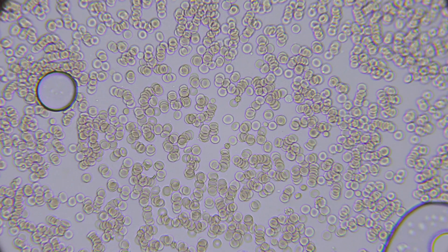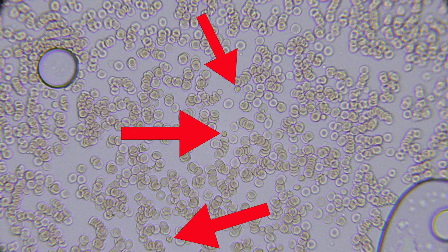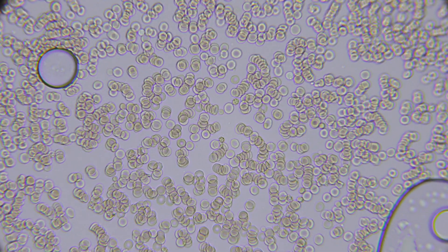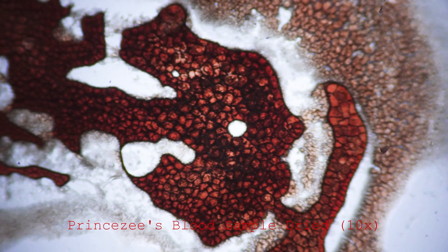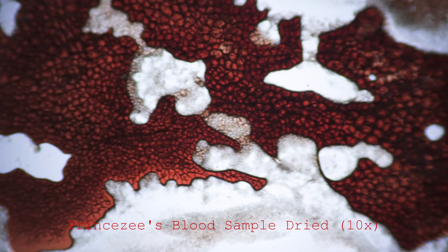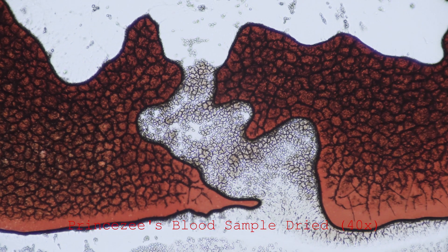Alright guys, if you still haven't found anything, don't worry - I got you. If you look closely, we have one over here, another one over there, and the last one over here. Look at all that. This is freaking science art.